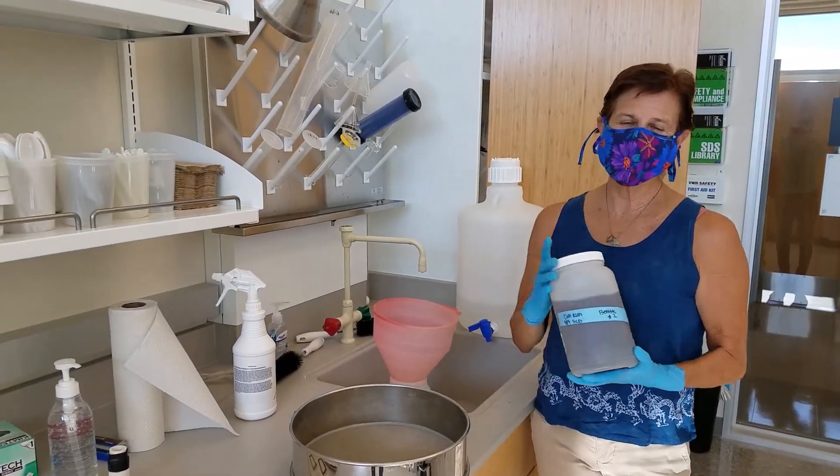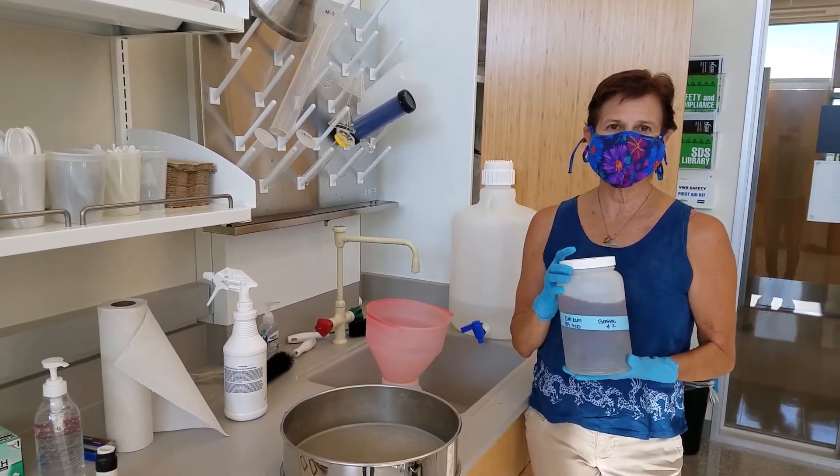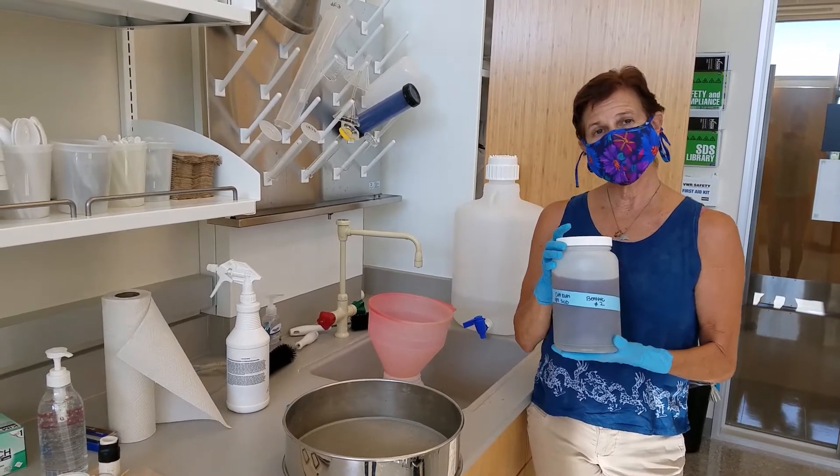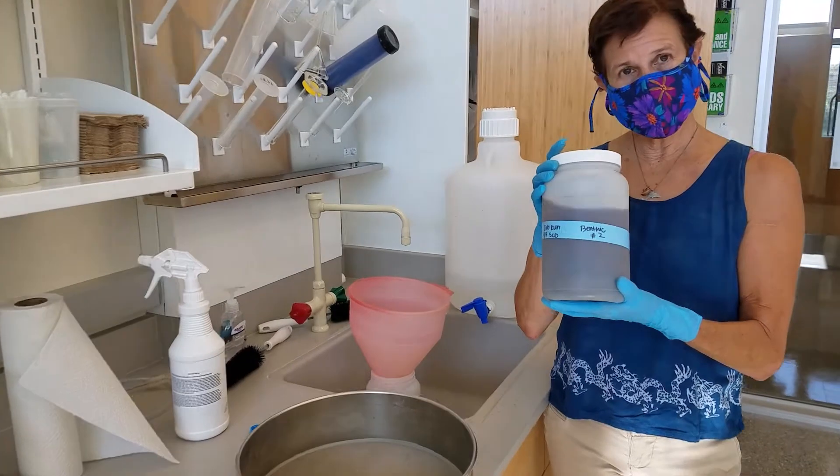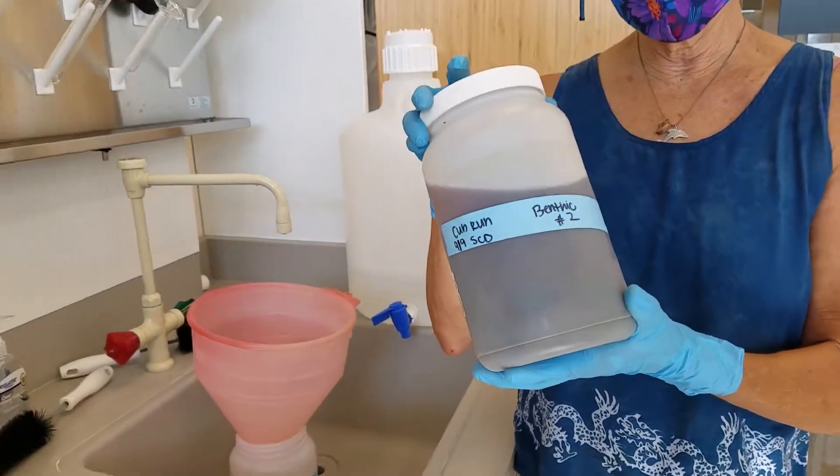Okay, so we're going to go through the lab processing for benthic macroinvertebrates. This is a stream sample that we collected a few weeks ago from Cub Run.